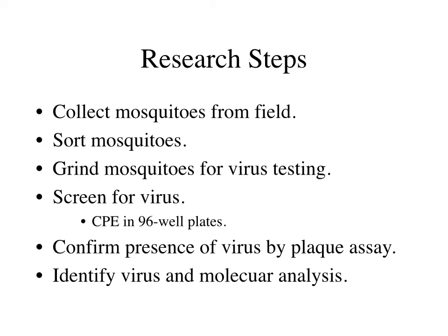We used reverse transcription PCR and a bunyavirus specific universal primer to produce amplicons of the small RNA segment, which was sequenced. We sent this out for sequencing, and then a BLAST query indicated that the isolates were Cache Valley virus.